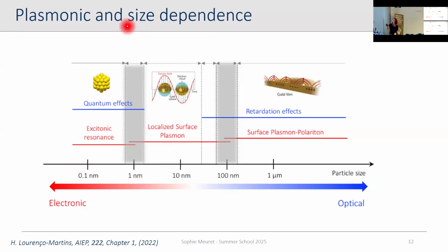What's happening here is basically cluster physics, when you have a lot of really small particles together, and here it's close to what we call whispering gallery modes, where you have, for example, a big sphere where your plasmon travels around the sphere. So that's much more difficult to explain theoretically.